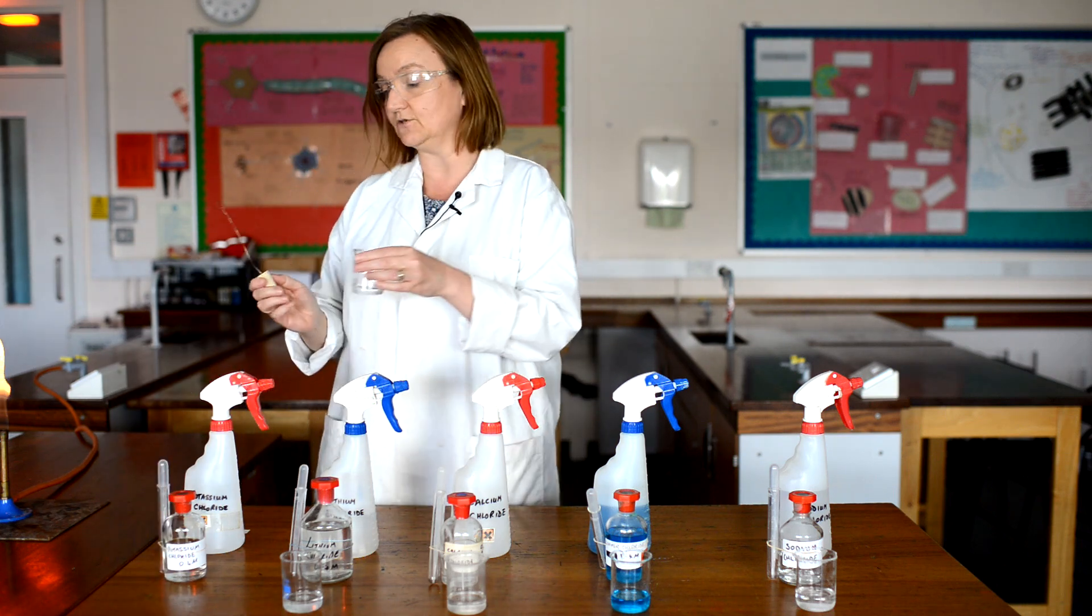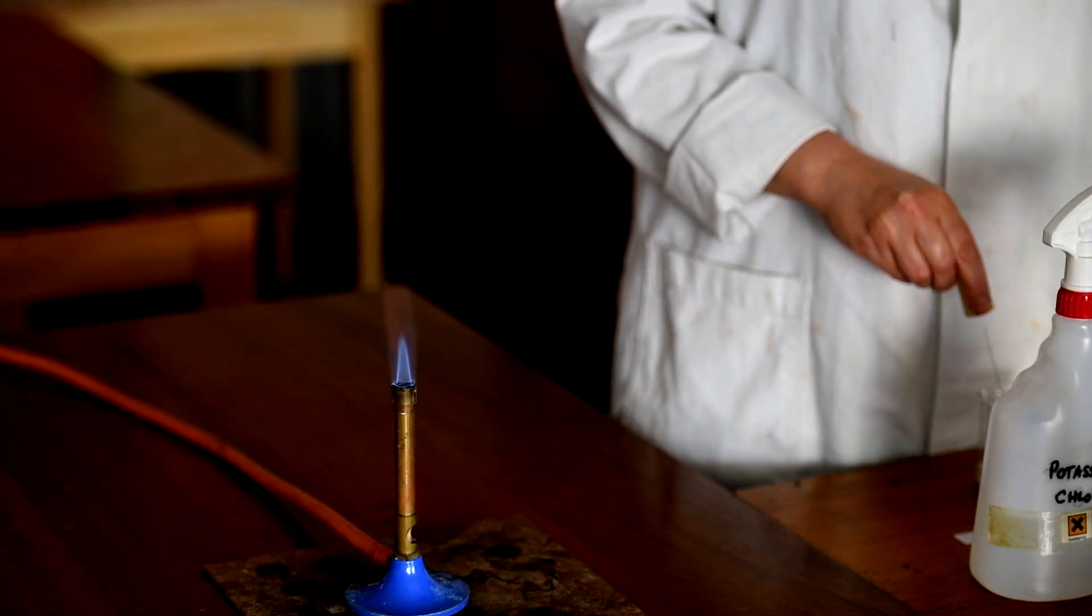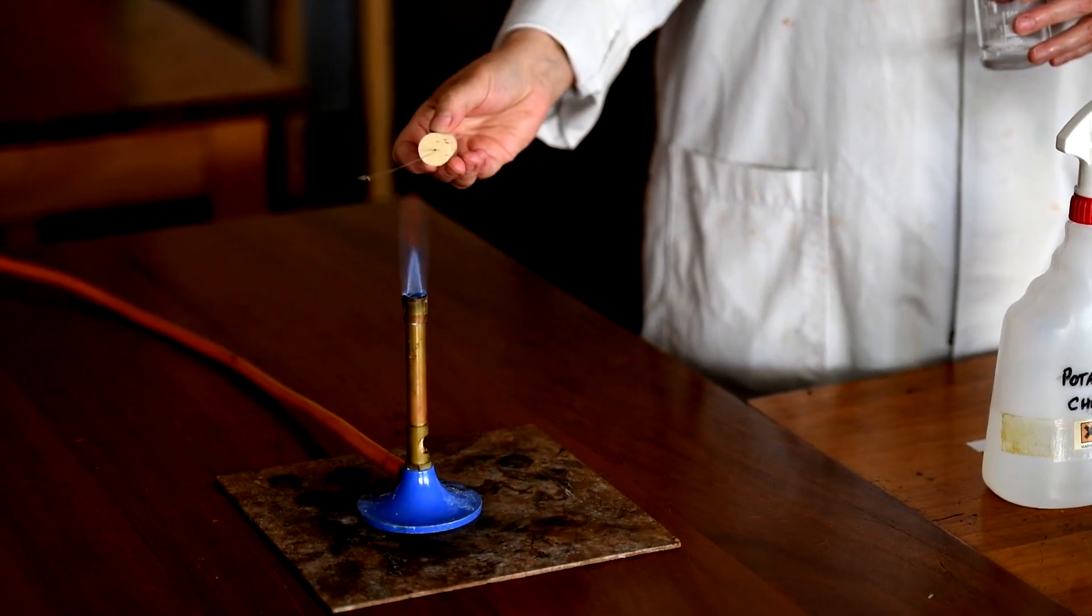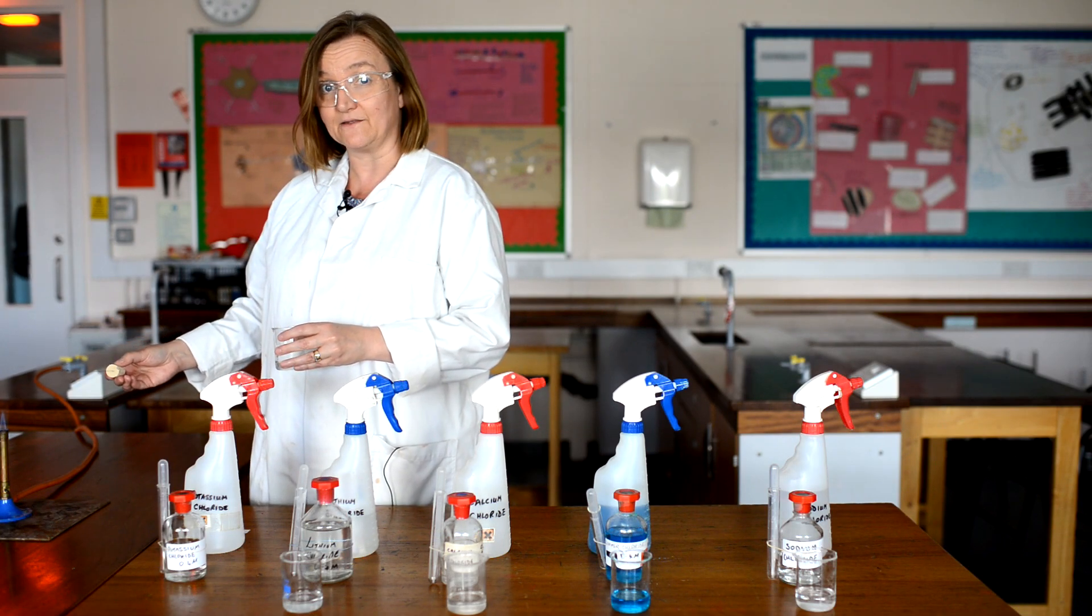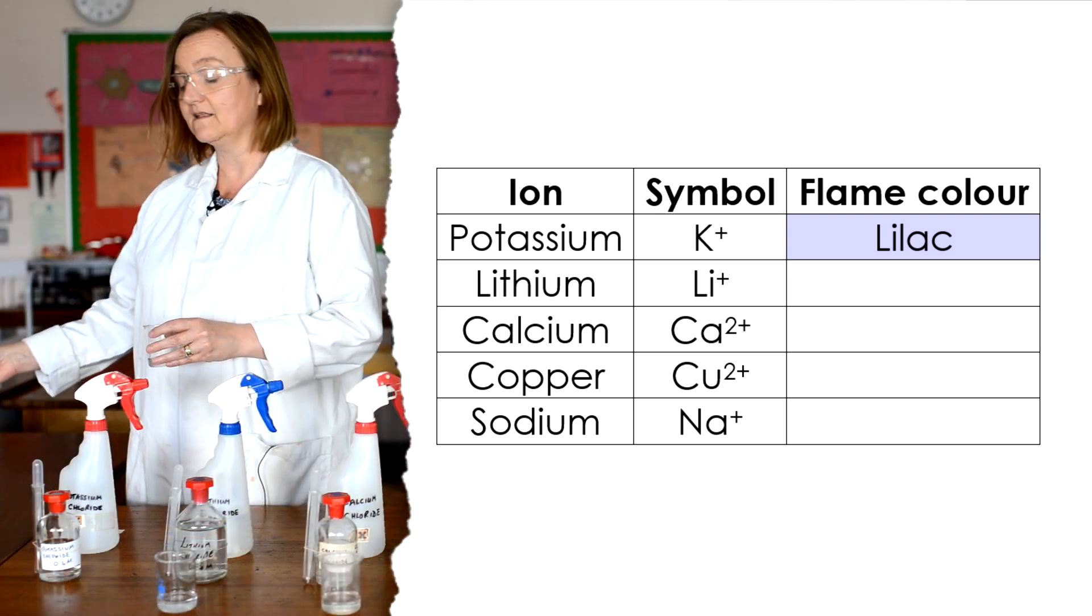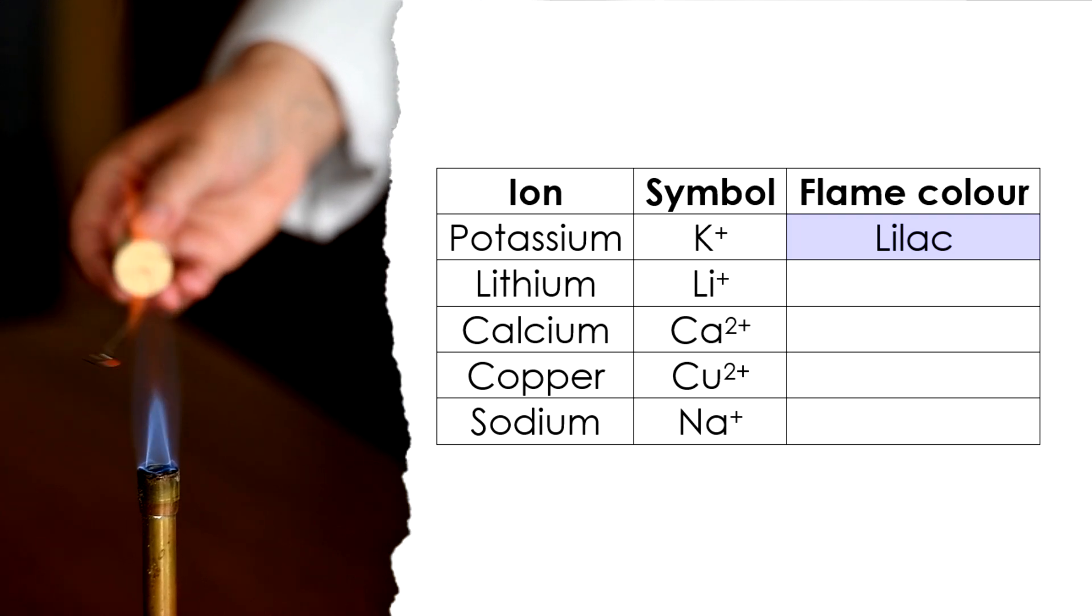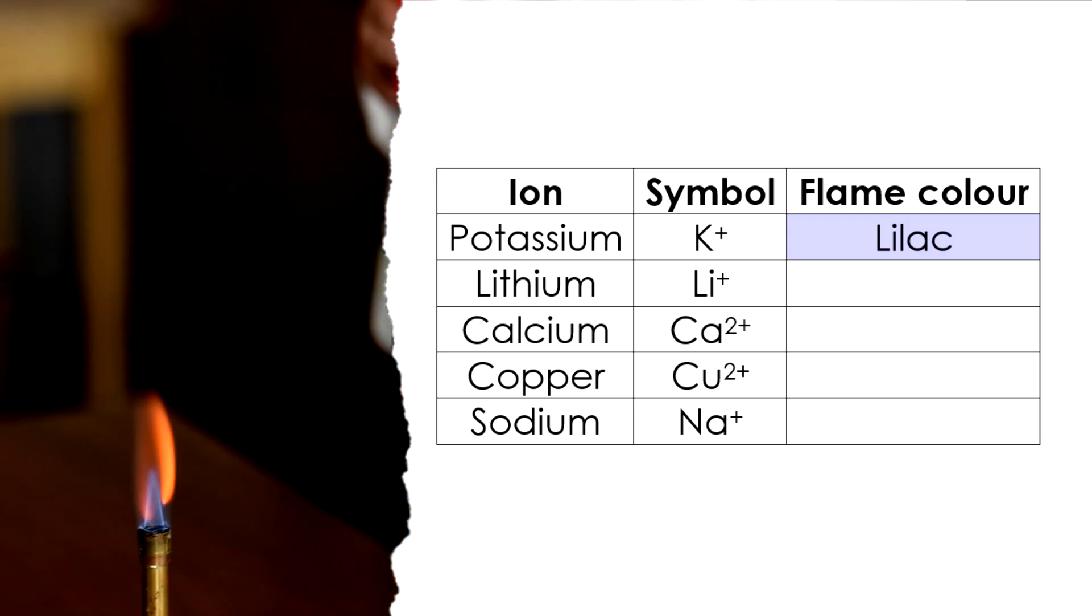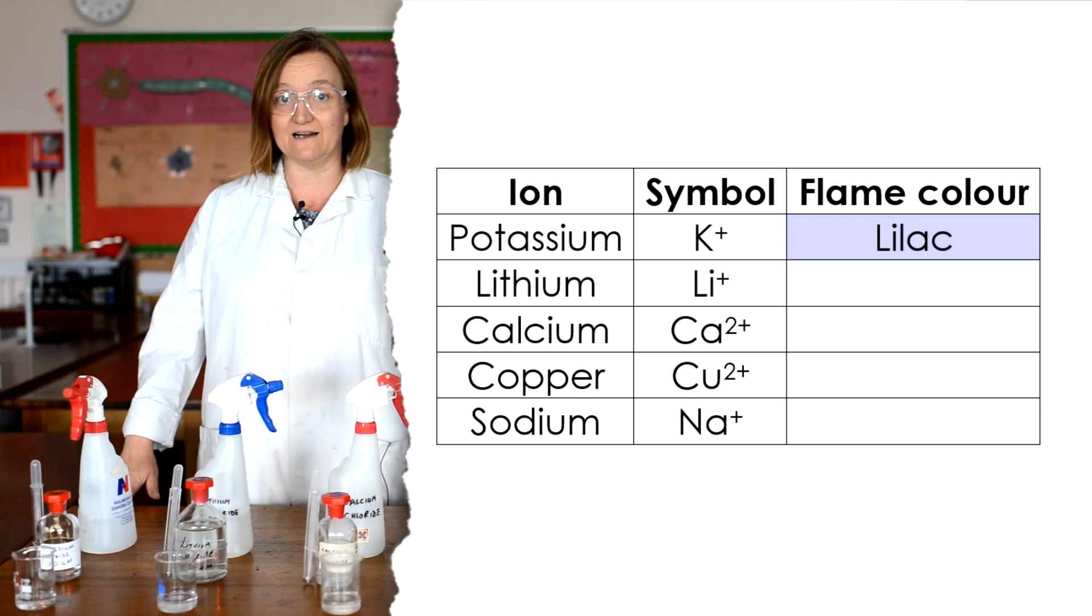So I take my potassium chloride solution, I open up the air hole on my flame so that it's a roaring blue flame, so there's very little colour in the flame itself, and then I dip my wire into the solution of potassium chloride, shake off any excess, and then just place it at the very edge of the flame. Now this colour is difficult to see. There is a bit of orange there, but it's not that that we're looking for. Look carefully and see if you can see a lilac purple colour. Do you see it? Just in the middle of the flame. I'll just do it one more time. Now you may, in class, have actually looked at this flame through a piece of blue glass. This actually gets rid of the orange colour in the flame and makes the purple easier to see. Let's see if we can see the colour any more clearly if I use the spray. Maybe not that much, but what you're looking for in an answer is that the potassium gives you a lilac flame in the flame test.